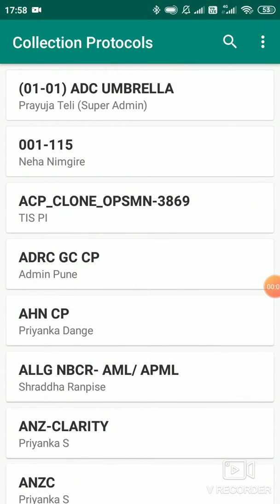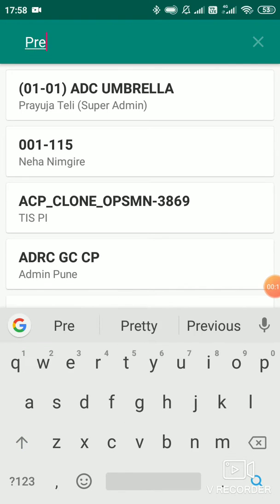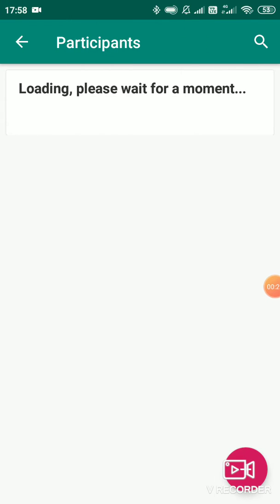Hello everyone. We are starting with a mobile application — how does it work, what is the workflow? Once you log into the mobile application, the collection protocol screen will appear. By clicking on this search option, you can select or search the collection protocol that you want to check.